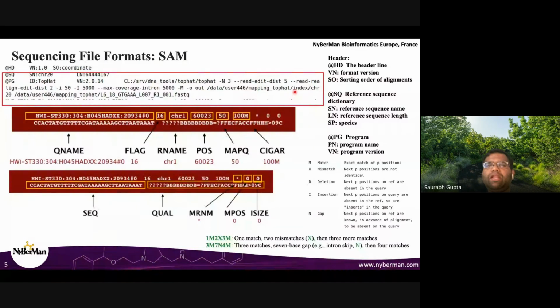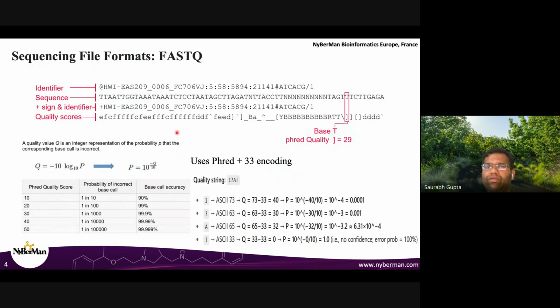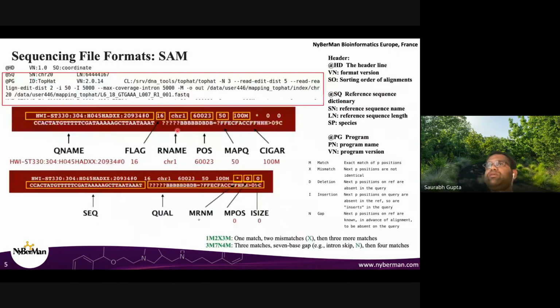So coming back to the alignment format. For alignment, what do we know? In this format, did we see anywhere where this read is coming from in the genome? No, exactly. So for that, this is actually what alignment is doing. In aligning the data to the genome, this is exactly what we're trying to do: the most important thing is which particular chromosome this read is aligned to, and which particular position in that genome.